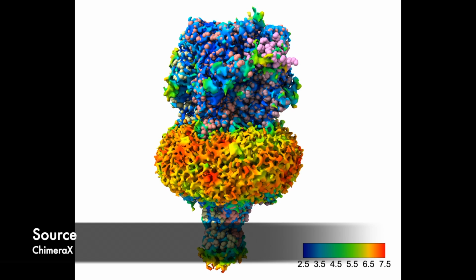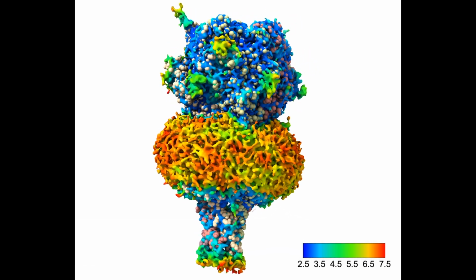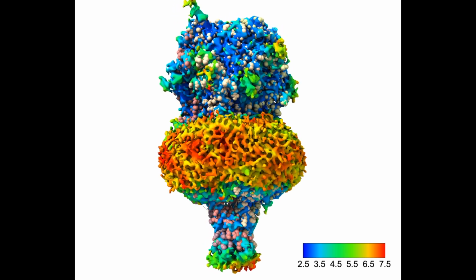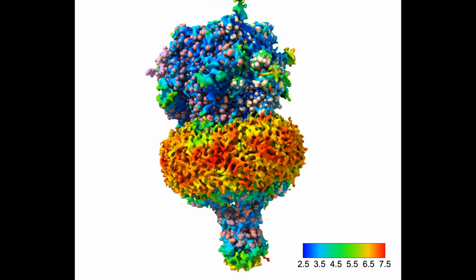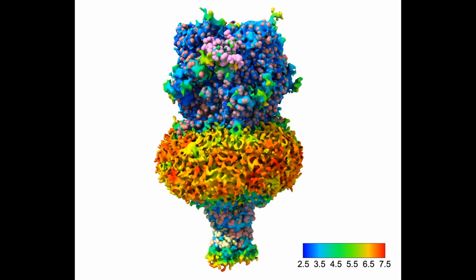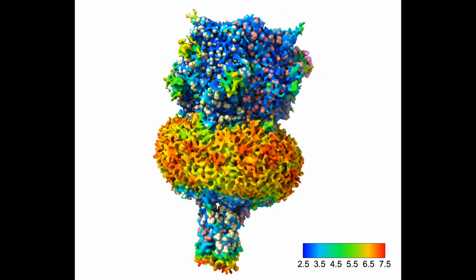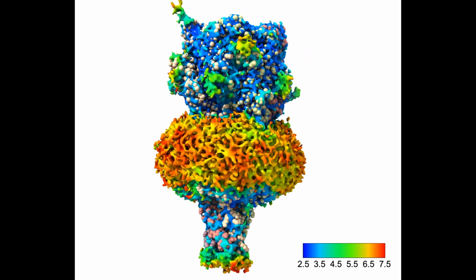And so that's what we're looking at here. It's basically just the map overlaid onto the model of the receptor as well as the toxin. You can't really see it super well, you'll see it better in the next image that I show you, but it covers this receptor pretty darn well.